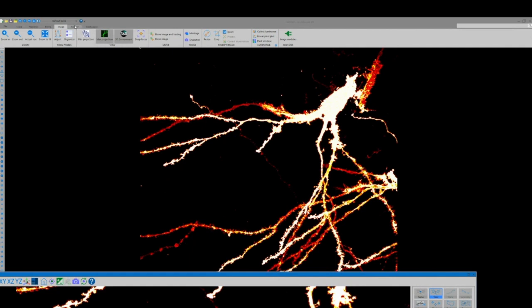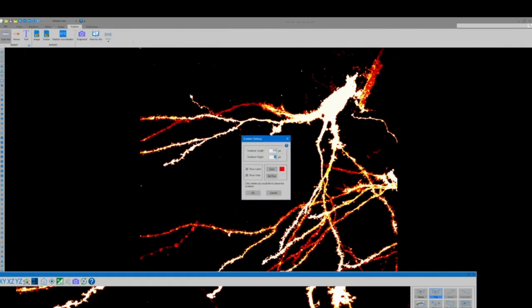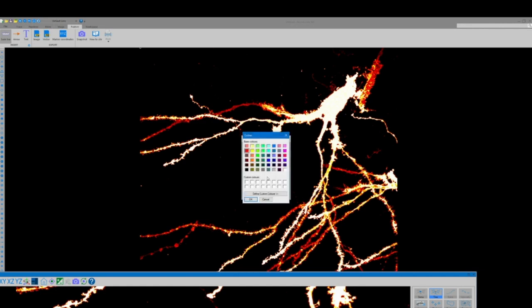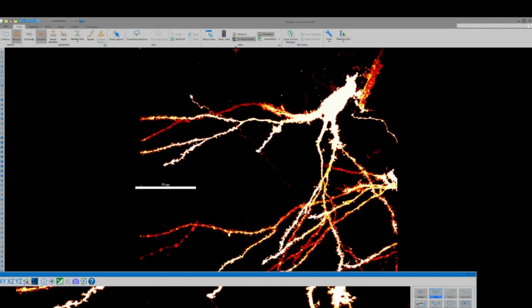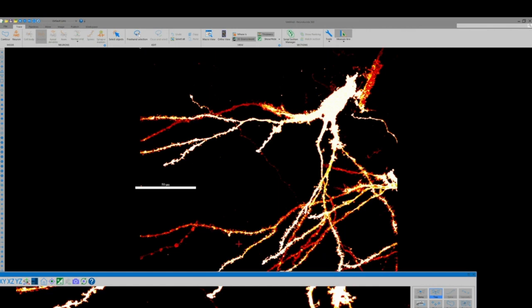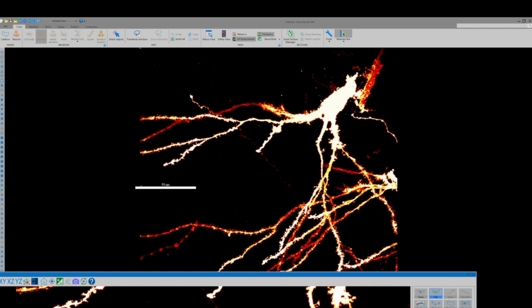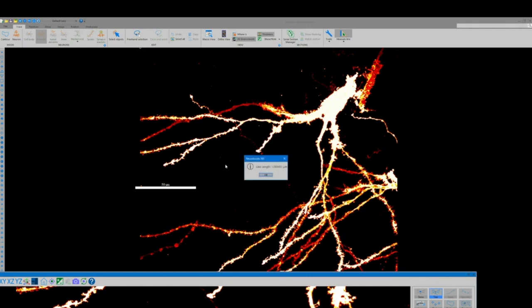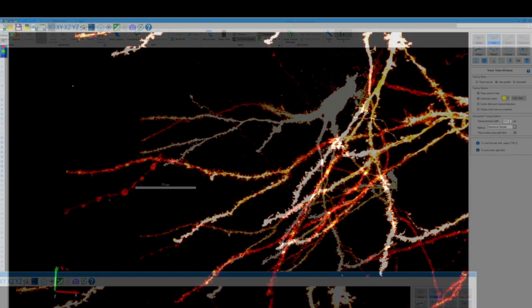So heading back to our 2D window we can add a scale bar for reference by going to the publish toolbar, selecting scale bar, and then clicking on the image where we want it to be displayed. You can also go over to the trace toolbar, select measure line tool, and measure various different process widths throughout our dendritic arbor, estimating an average width to help increase the accuracy of the user-guided tracing software.